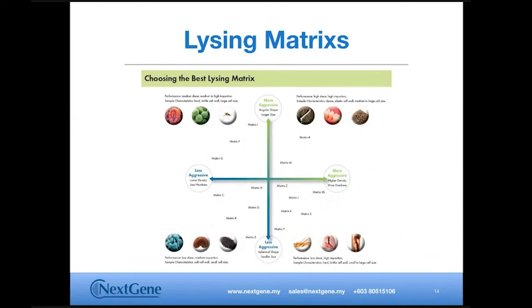Okay, so I think I will take the question. For troubleshooting, we might need a little bit more information, so we might contact Wanwan later. We need to know the current homogenizer that you're using and the duration, how long you actually perform the lysis step. From there, we can see what we can do, whether to prolong the time or to change.